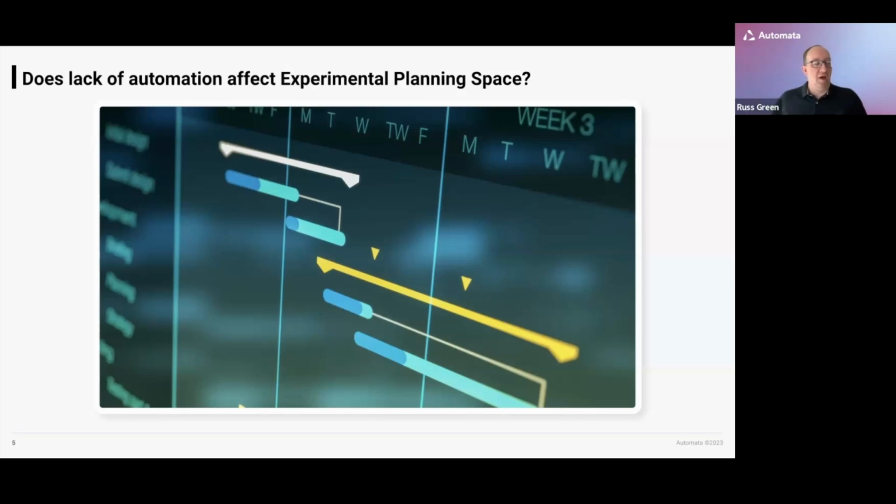So I can't put a number to it exactly, but it's a very large proportion of the clients I've spoken to and consulted with about automating tissue culture in particular, or tissue culture centric experimentation. They always say the same kind of statements. I always start my experiment on insert day of the week, so that I can avoid coming in at the weekends as much as possible, which I totally get. I mean, who wants to be in a laboratory over the weekend, gazing out, especially this time of year when everyone else is having a joyous time in the sunshine, when you're sat there with your hands in a tissue culture hood, carrying out media exchange.